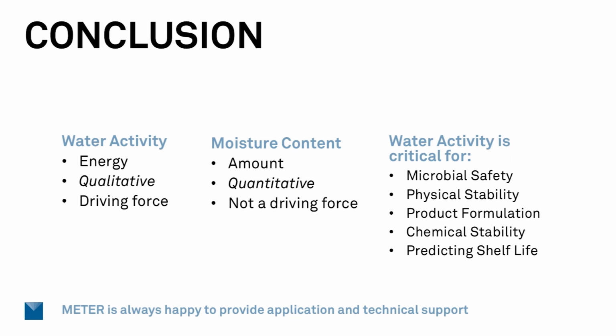Oh, good question. Actually, measuring the water activity during the process and at the end can be really useful. If you remember our caking and clumping issue that we had before, if that manufacturer had measured the water activity in the incoming raw ingredients, he would have known immediately that there was a potential problem with the caking and clumping.